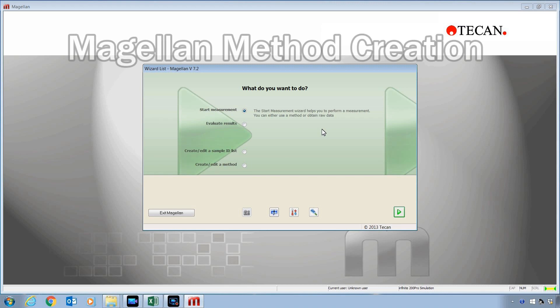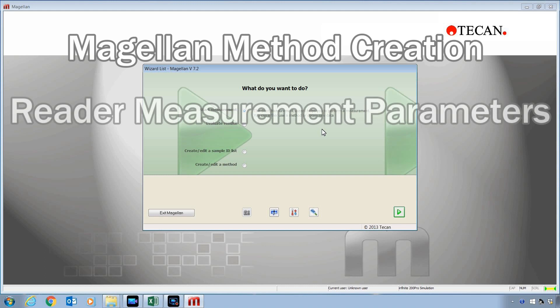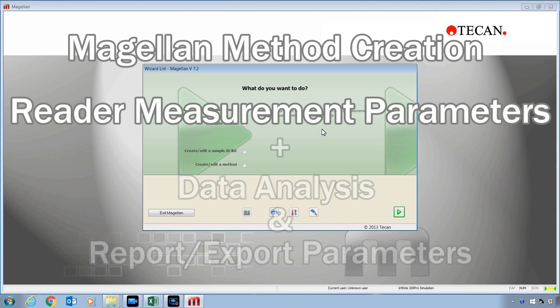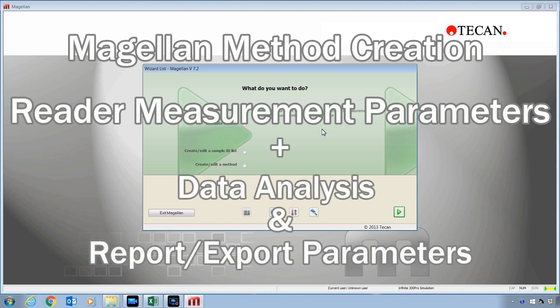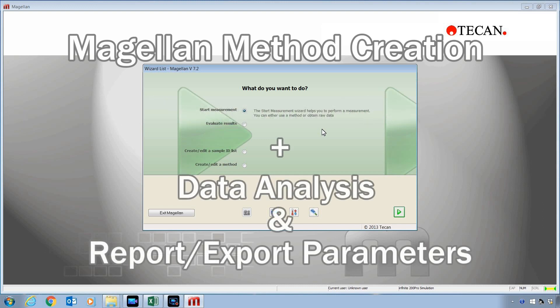Method creation with Magellan can be thought of as a two-part process. Part one is the creation of the plate reader measurement parameters that will be used to generate your data. Part two is the creation of the analysis and report parameters. This video will focus on part two. Please look on this channel for other videos that explain how to create and optimize reader measurement settings for your specific detection mode.